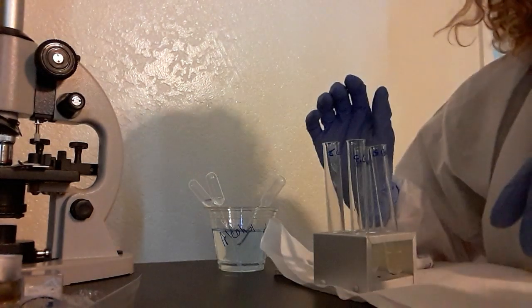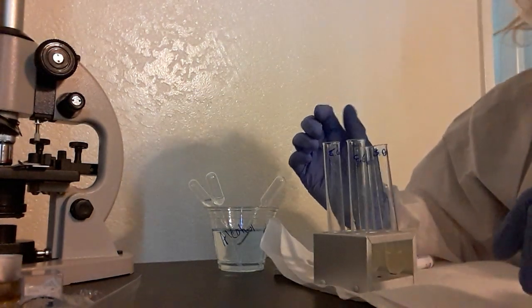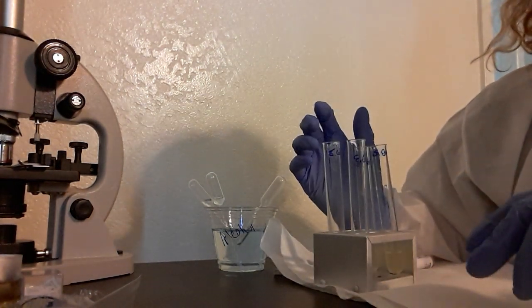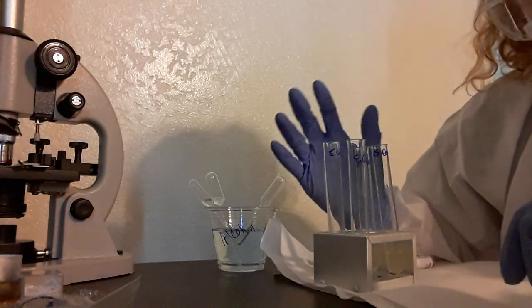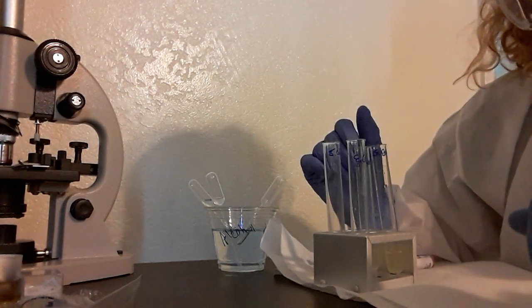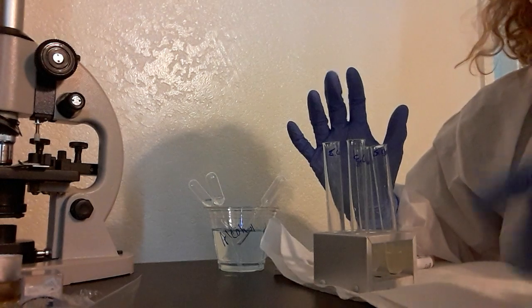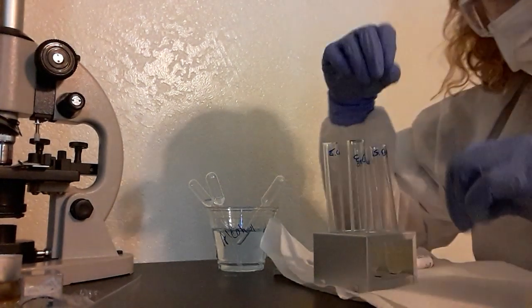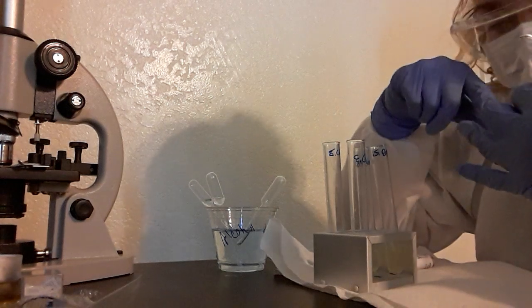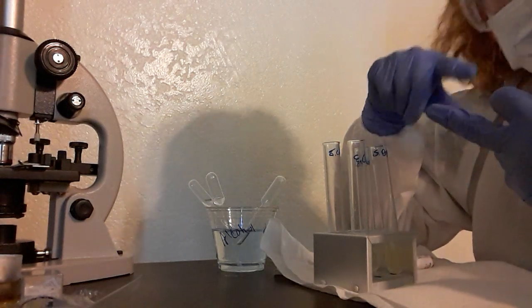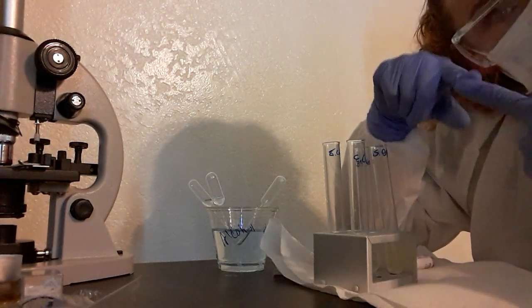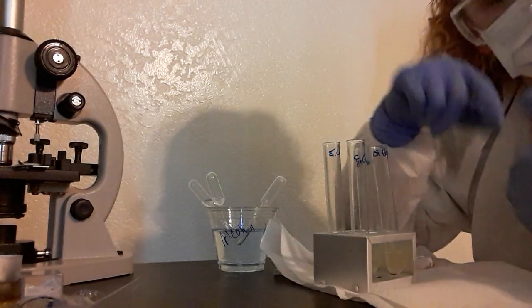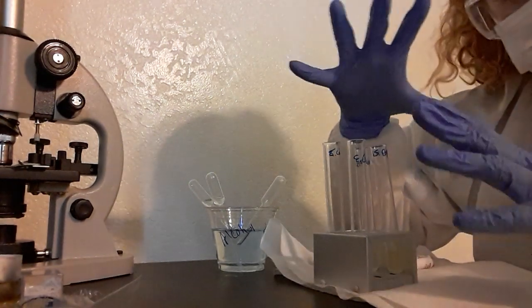This testing, the first one I'm going to do is the methyl red testing. This is going to identify microbes that perform mixed acid fermentation. It's an anaerobic metabolic process. What happens is it produces lactic acid, acetic acid, ethanol, carbon dioxide, and hydrogen gas. That's a lot of stuff going on.